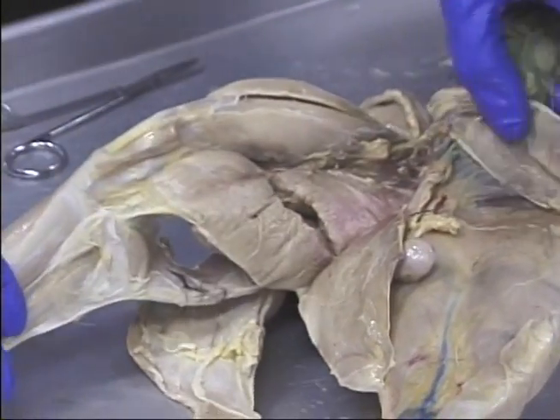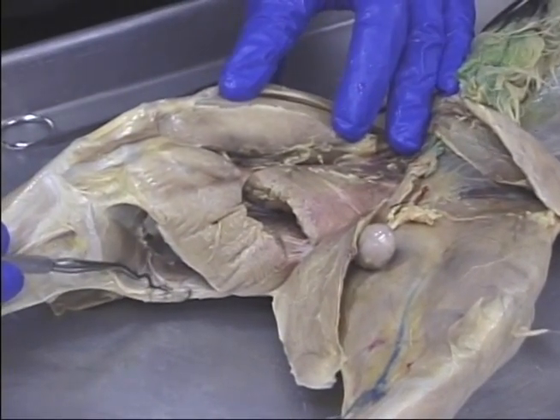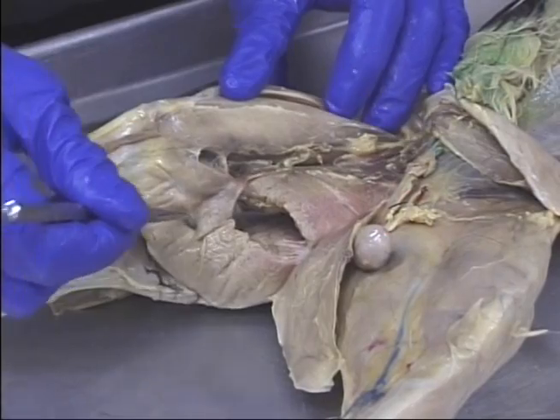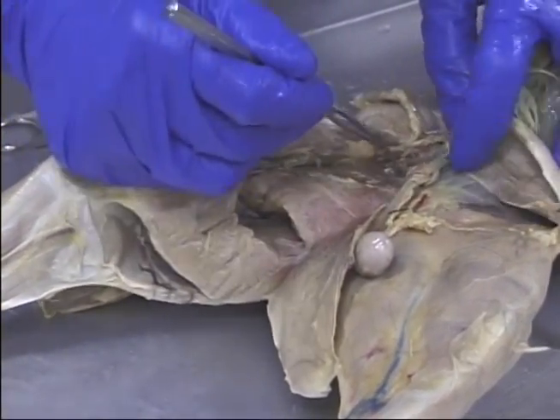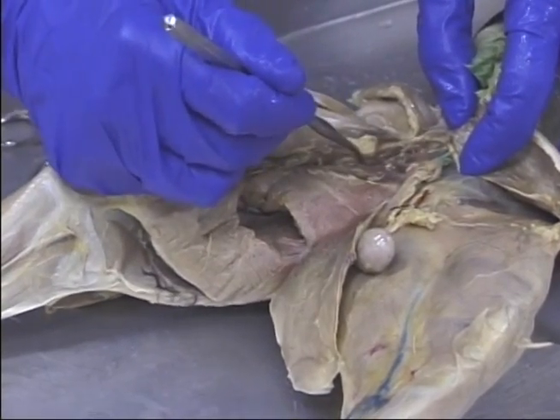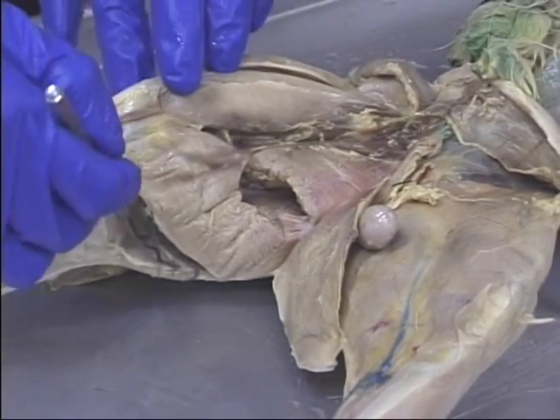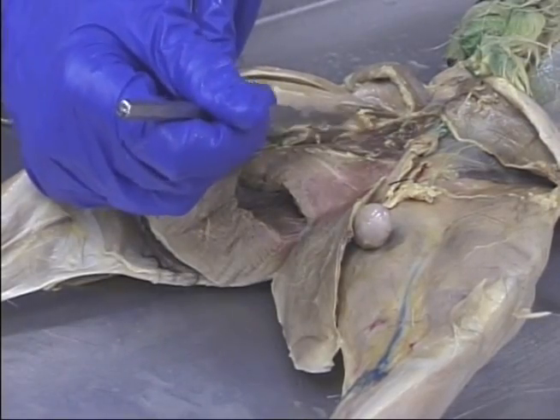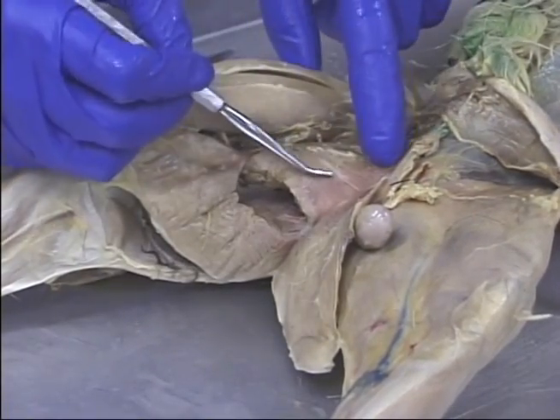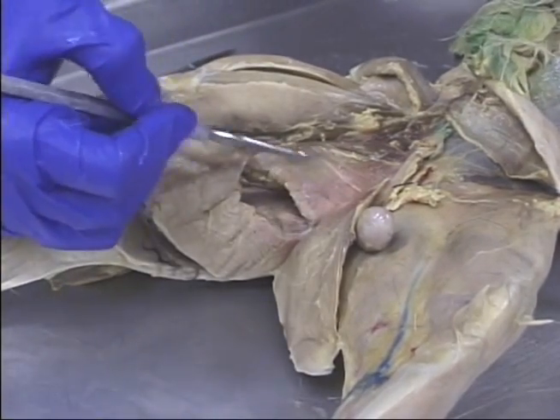Now let's turn the animal over and look from this side. From this side: semitendinosus, semimembranosus, adductor femoris. This one is the adductor longus, this one here is the pectineus, and this one here is the iliopsoas. I want you to notice there are multiple heads to the adductor femoris — don't split those in half.